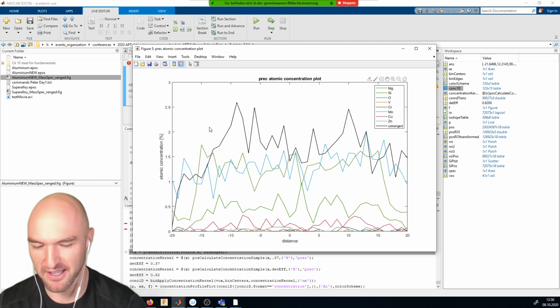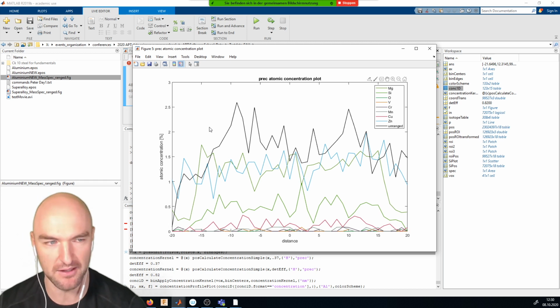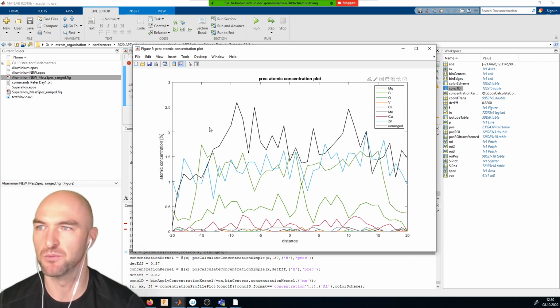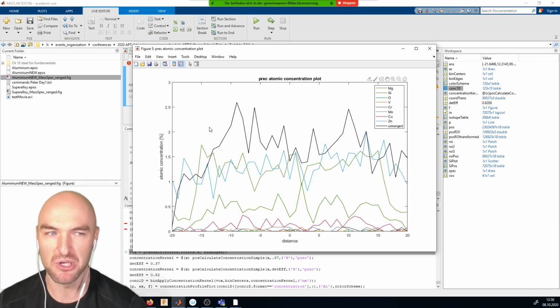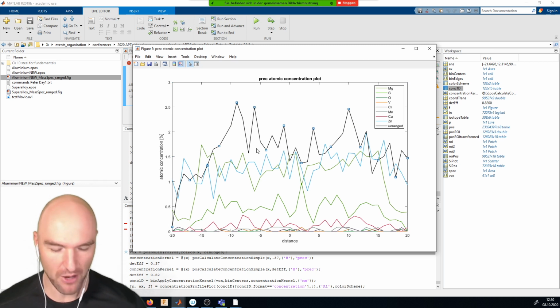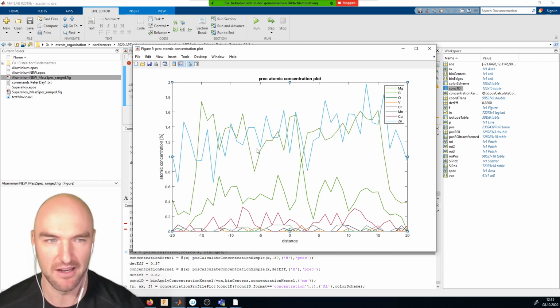But this is also a very good send-off that we need better concentration kernels that do a better job at estimating what the errors are. And I think adopting something like the programs from Andy London would be a very good way there, where you actually do a maximum likelihood estimation of what the actual error is. I think this would be in the future really, really helpful. For now, it's a variance, the expectancy value of the variance, and we usually plot a confidence interval for that. And I think that's something you usually can see pretty okay in the data as it is. And so I don't think it's that helpful to plot it. Also, now we're working at a very, very small volume, but usually we work with much larger volumes, and there they become so small that you can hardly see them anyway. And it just gives the impression that that's the error, and it just isn't.